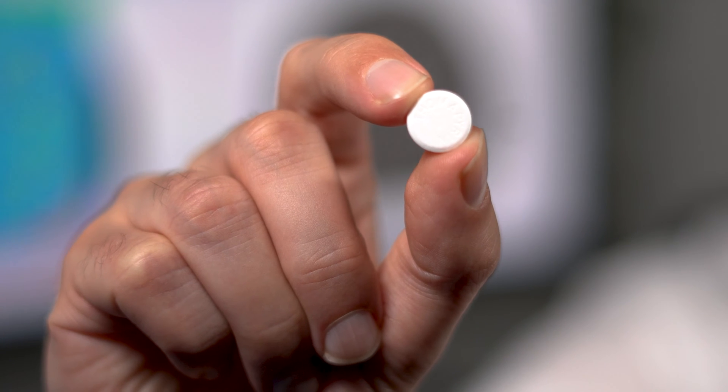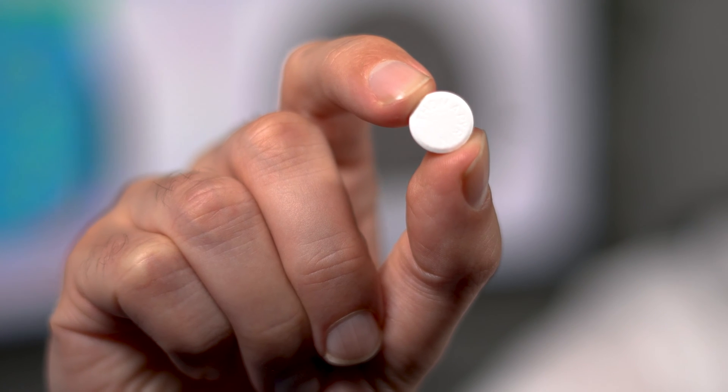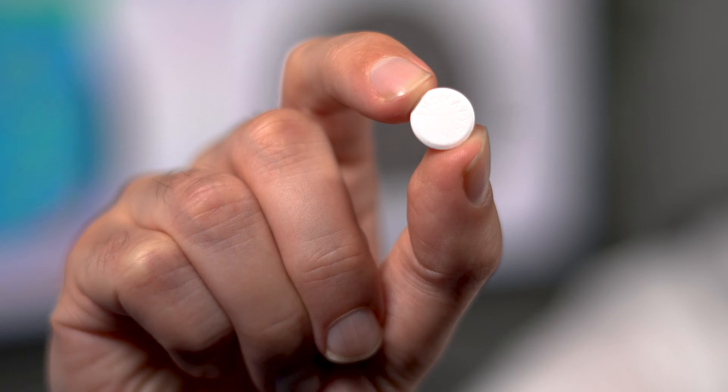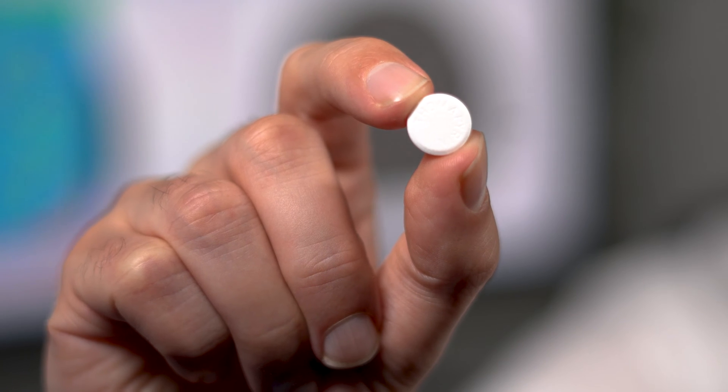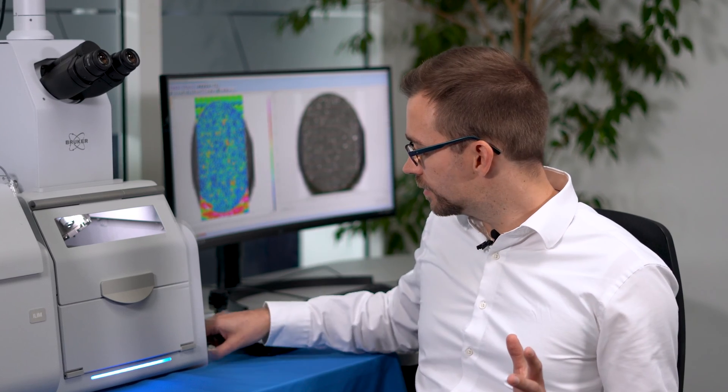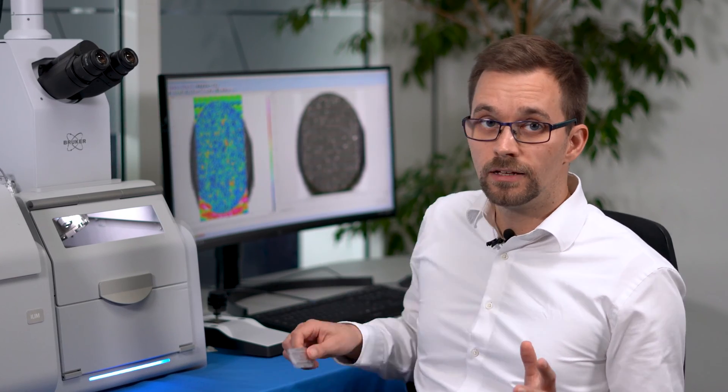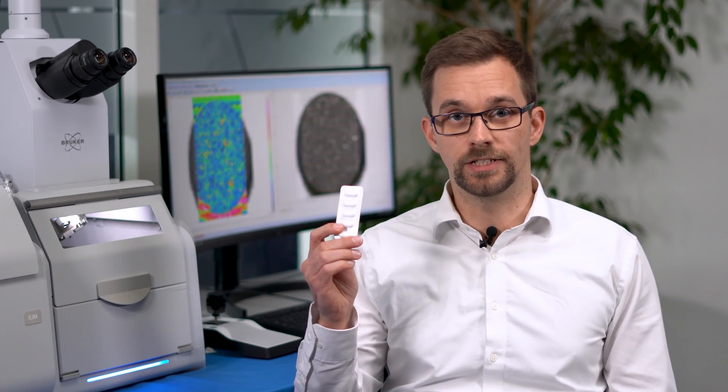This is a painkiller tablet made to alleviate light cold symptoms and headaches. Its internal composition is finely tuned to guarantee the safe and effective release of its ingredients, and it's imperative that the amount of active ingredient is the same in each and every tablet.